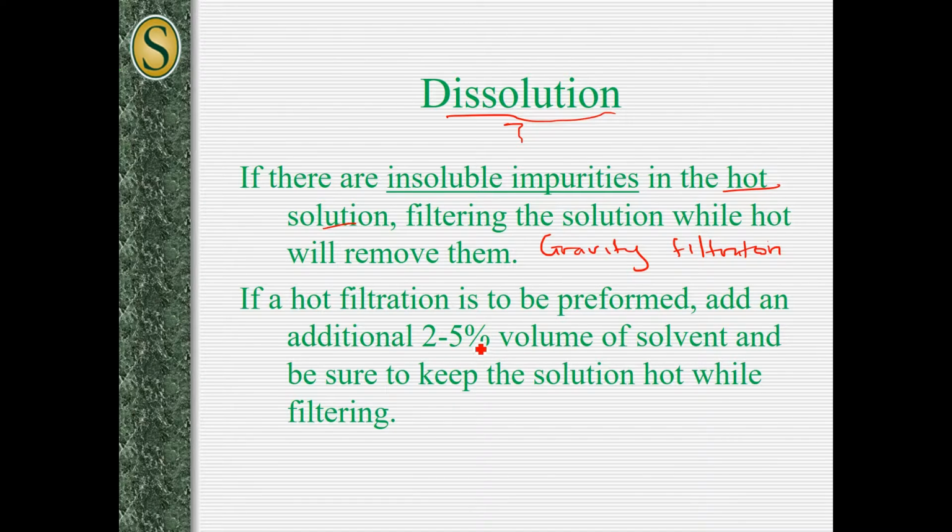If too much solvent is lost because of filtration, we'll add some more, 2 to 5% if need be, to make sure that the solution is hot and well solvated.